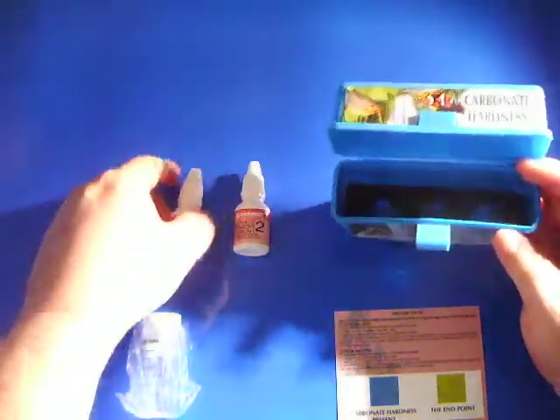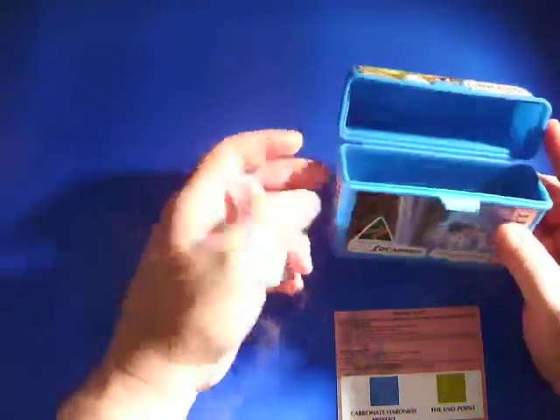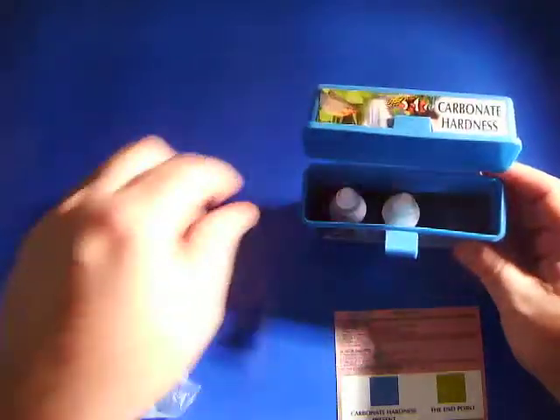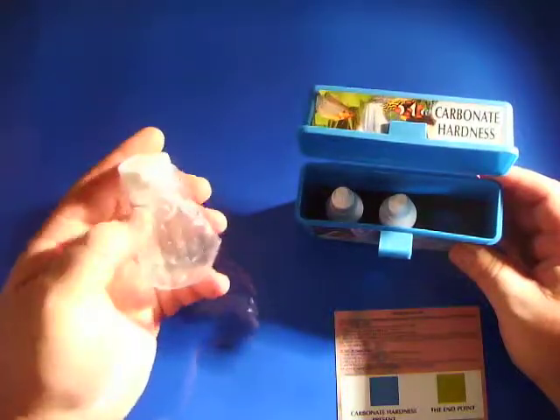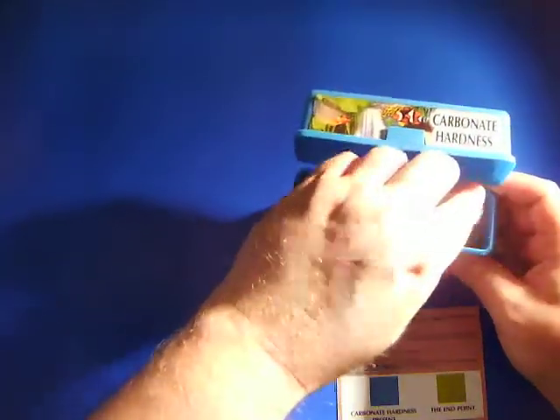So it is a good kit — plastic, so if it does get wet it is not going to fall apart or deteriorate. The reagents go away nice and neatly, and the test vial is made of plastic, not glass, so it is less likely to break. You can also buy the reagents separately if you wish.